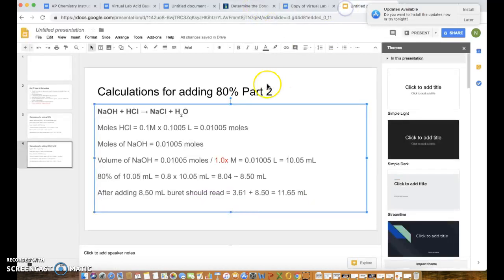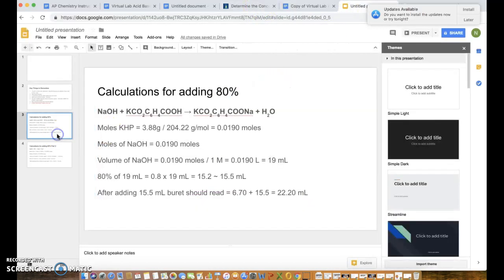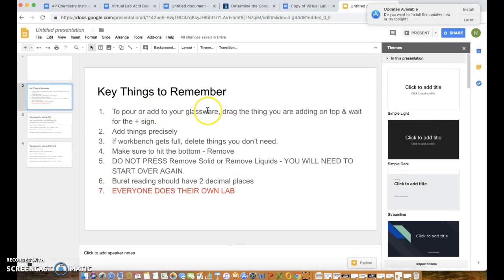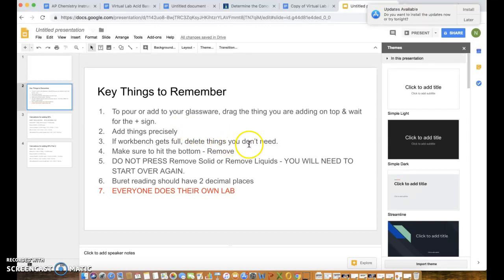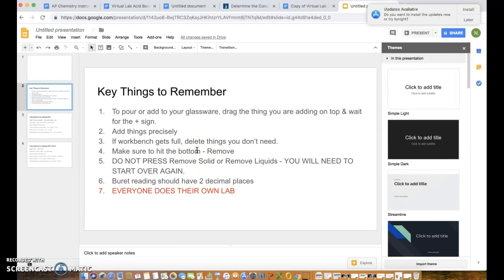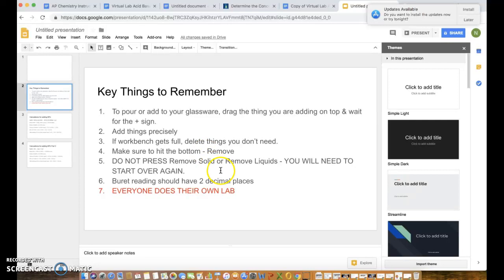Finally, I just want to recap some of the key things for this lab. Make sure that when you're pouring the glassware, when you're adding something to your glassware, drag the thing on top. Add things precisely, don't use the realistic. If your workbench gets full delete things you don't need. Make sure to hit the bottom remove, not remove solids. Don't hit remove solids, hit where it says remove not remove solids not remove liquids because if you do that you'll have to start all over again. And finally the burette reading should have two decimal places.